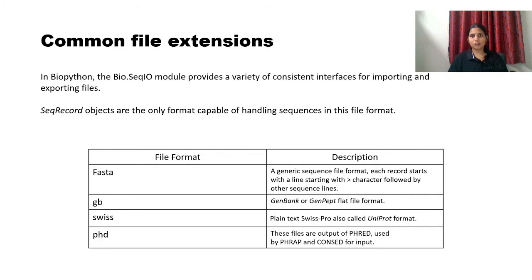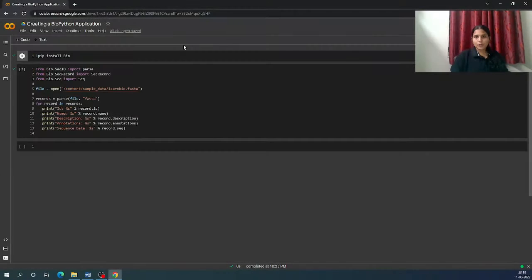There are also other commonly used formats such as PDB for atomic protein structural determination, FASTQ, a variant of FASTA with Sanger, and FASTQ Illumina used for storing Phred scores. Those were all the concepts and necessary terms needed before getting into creating a BioPython application. Now we will create a simple BioPython application to parse a bioinformatics file and print its content. This helps towards understanding the general concept of BioPython and its usage in bioinformatics.